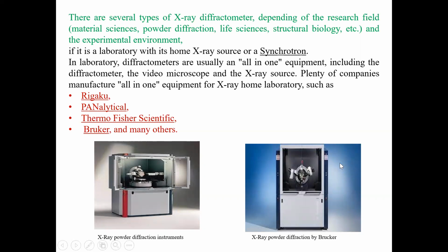So these are the instruments which are used to characterize the nano materials. So these are the companies we are using to prepare this X-ray diffractometer. One of the best companies is Bruker, which gives all the informations of X-ray diffractometers and the nanomaterials.